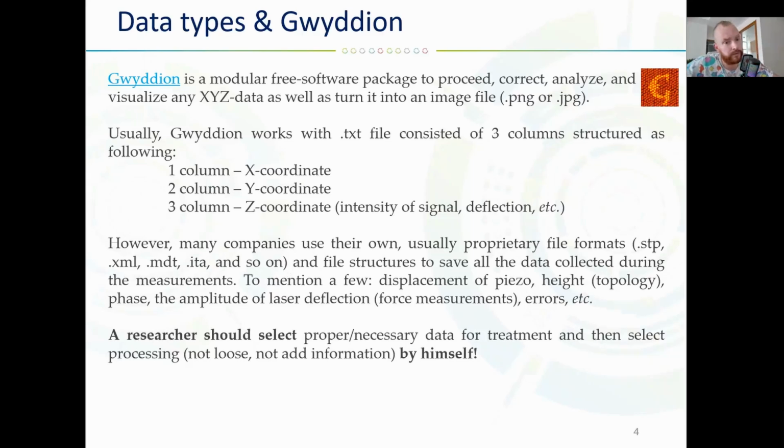So you just need to search, like in Baidu or Google or Yandex, for Gwyddion import of this type of files. For example, it could be MDT if we are talking about MDT. It could be STP, XML, and so on. So there are many of them.